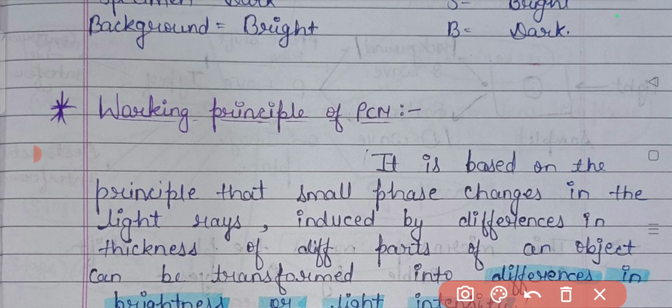Okay, again, the role of the phase shift ring is that it shifts the background light by 90 degrees. And one more concept related to the working principle of the phase contrast microscope is related to the refractive index or the thickness of the specimen. Suppose this is your specimen.